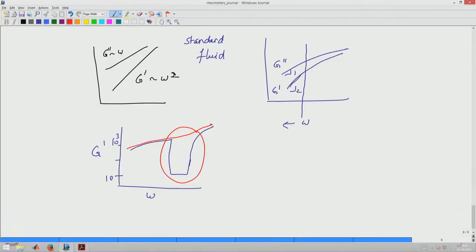But then you could also argue that given this was subjected to high strain rate, it now has a different trajectory. So, it is always going back and forth between some of these, but this is how we proceed with the analysis. All these arguments you have to bring to the fore to finally conclude, because for this sample you are the only one, or you are one of the few people trying to do measurements for these samples, either in an engineering application scenario or in a research scenario.